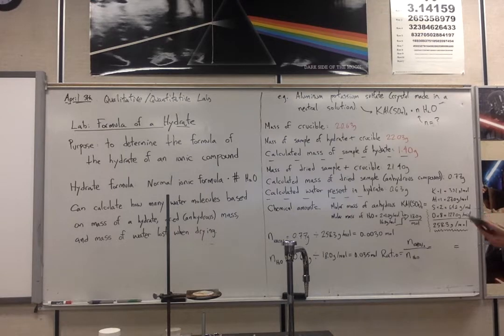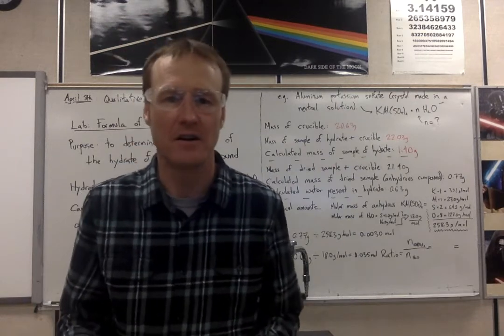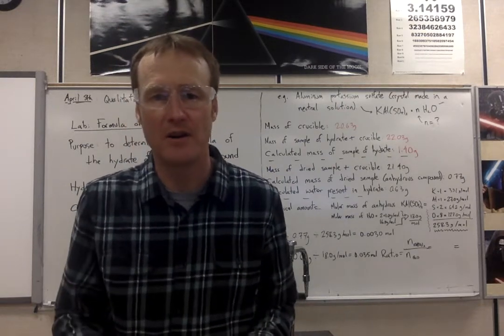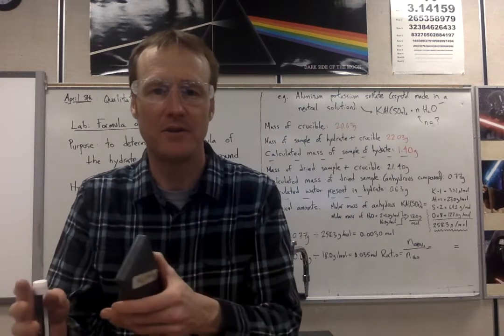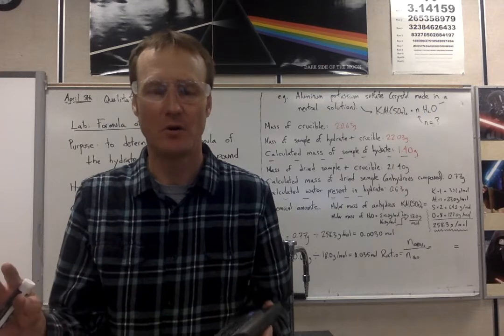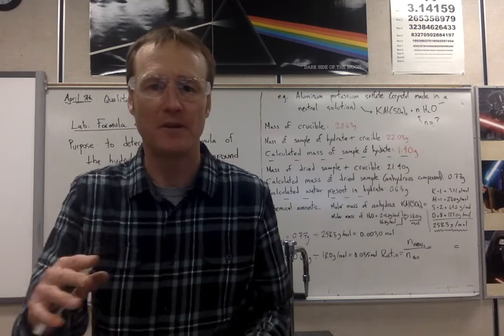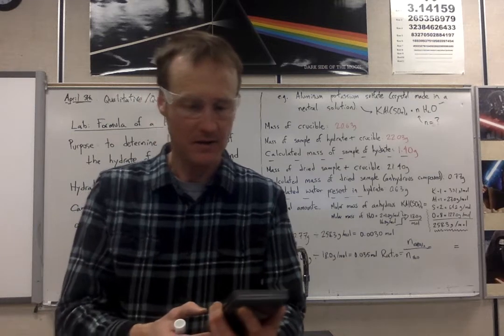That was the other chemical amount. Notice when I do this, I'm doing everything from the start, so I don't make any rounding errors. You don't find a value, round it, find another value, round it, and then use that to make your final calculation. That's a no-no. You want to keep your rounding to the very end. This is very important for when you're doing physics.